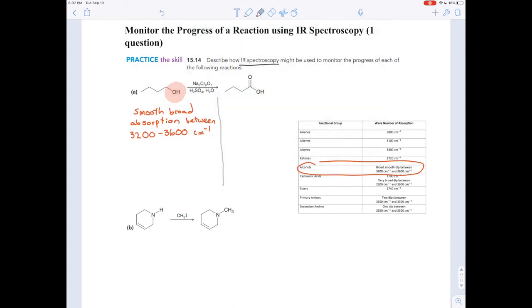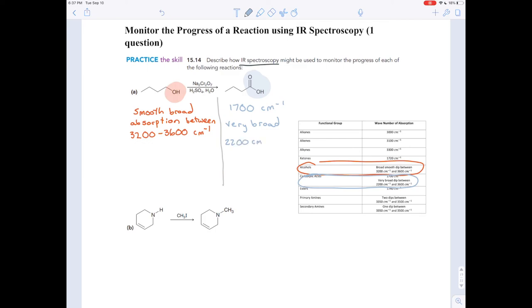On the right, notice the functional group you have here — that's a carboxylic acid. A carboxylic acid has two functional groups. First, you have the sharp spike — a dip at around 1,700 wavenumbers. That's your first difference. And then you have a very broad absorption that takes up around a third of the spectrum between 2,200 and 3,600 wavenumbers.